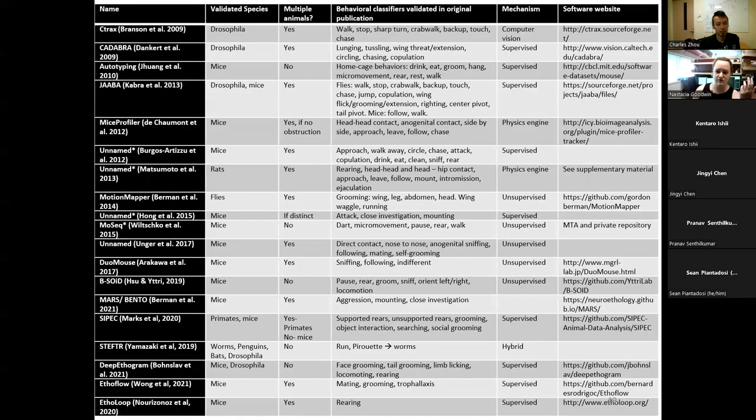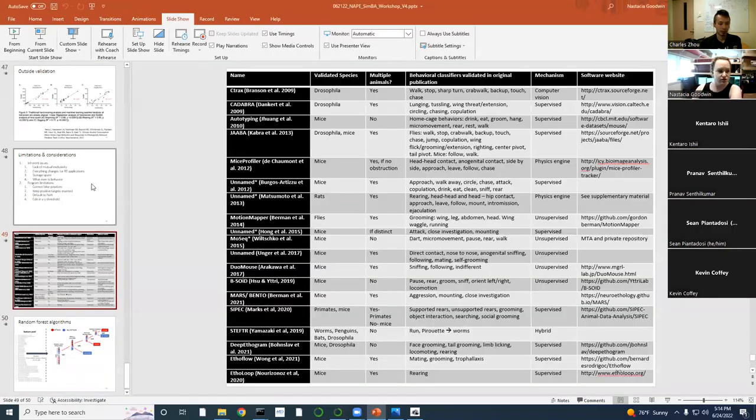If you're using different types of pose estimation, you may need to think about altering those feature extraction scripts, just to make sure that you're catching all of the relationships between the pose points that you think are important. Okay, and I might have missed it, but is that default specified in the documentation, or does it come within the pip package that we downloaded? So it comes with the package that you download. Yeah. So if you just hit feature extraction, it will calculate those features for you.